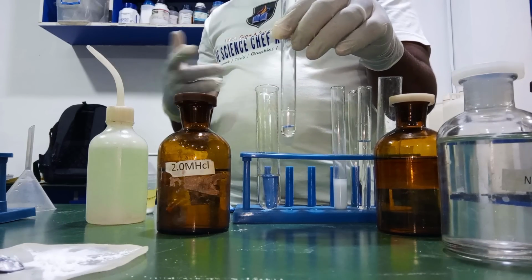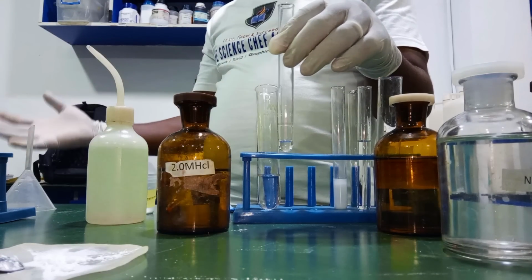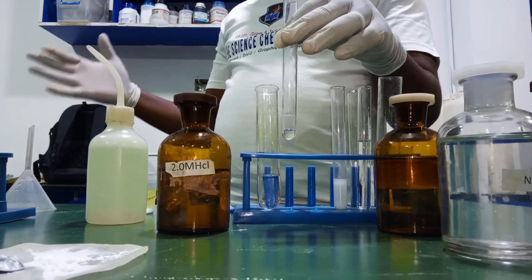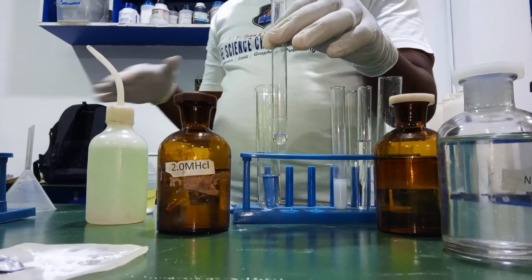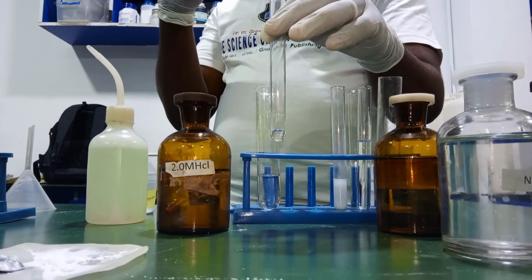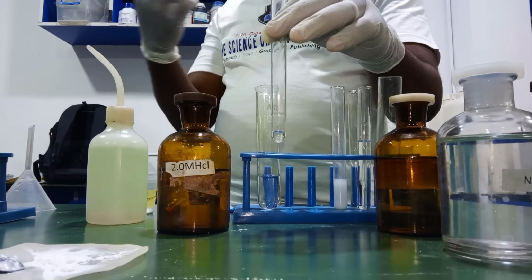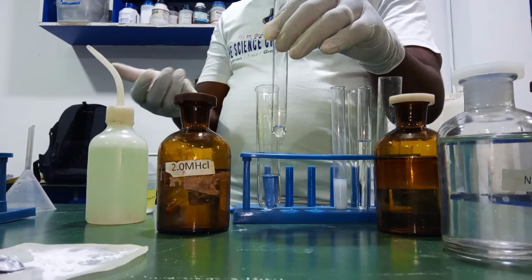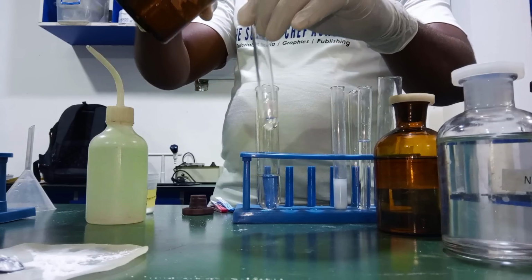Though you will be asked to warm the precipitate, which is expected to dissolve on heating, and allowed to stand, and by so doing, the precipitate will reappear. Unfortunately, I'm not going to do that because it's already obvious that lead(II) ion is present. But you can try it out. You warm it, it will dissolve when heated, and then allow it to stand or cool. The white precipitate will reappear. All right? So let's do that.